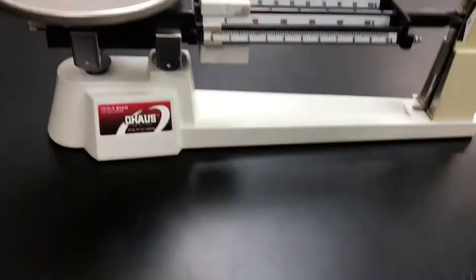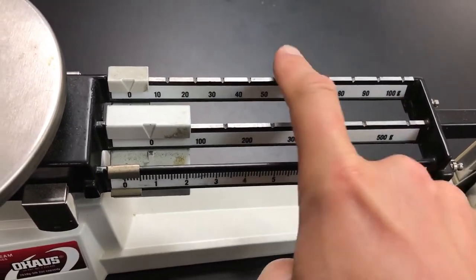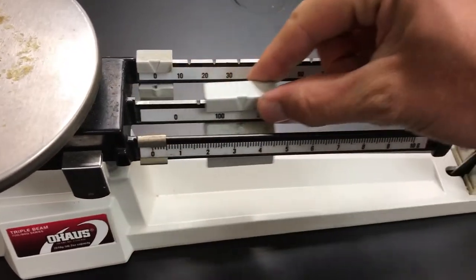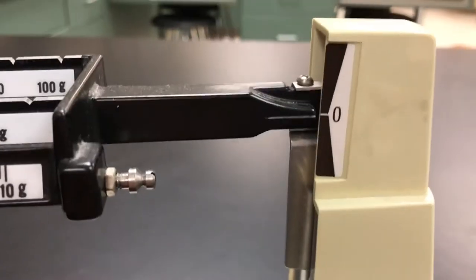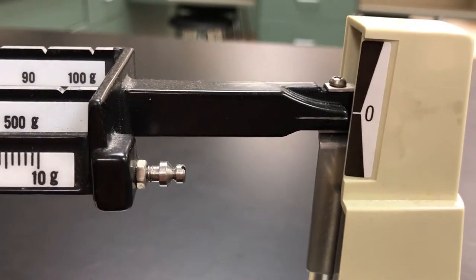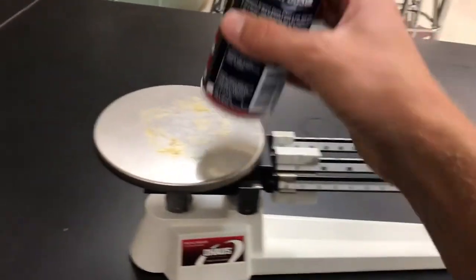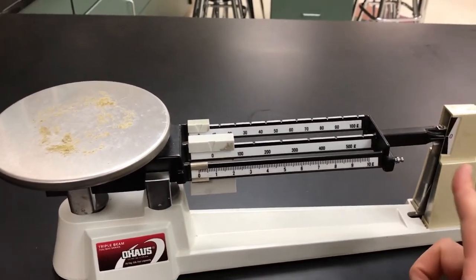So let me show you the triple beam balance. It's called a triple beam balance because there are one, two, three beams. These weights are called riders, and they ride across the beams. You've got your pointer over here — it should be at zero before you start anything. You've got your pan — that's where you place your object. First, make sure your riders are at zero and your pointer is at zero, then place your object on top of the pan.